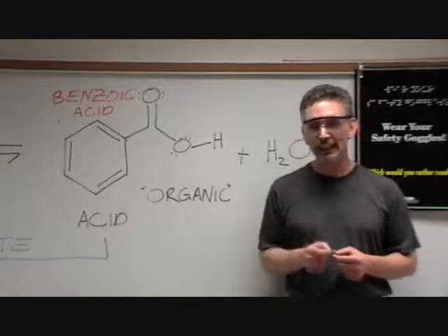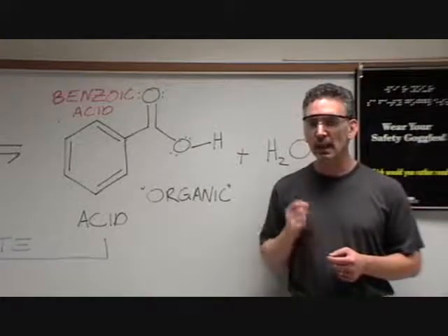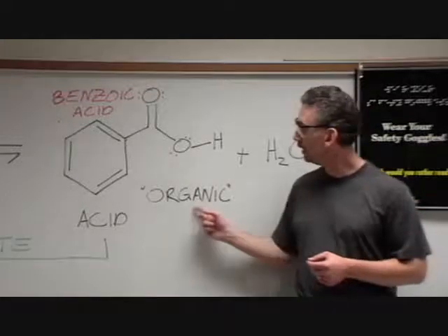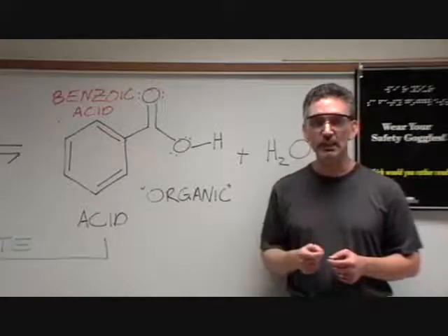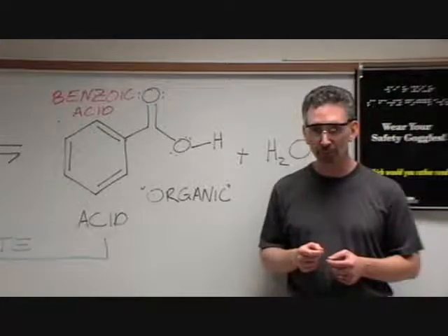So if we do get chemical change in your experiment today, there's a high likelihood that you'll form a solid precipitate of benzoic acid. Insoluble in water, it's soluble in organics like dichloromethane and diethyl ether.